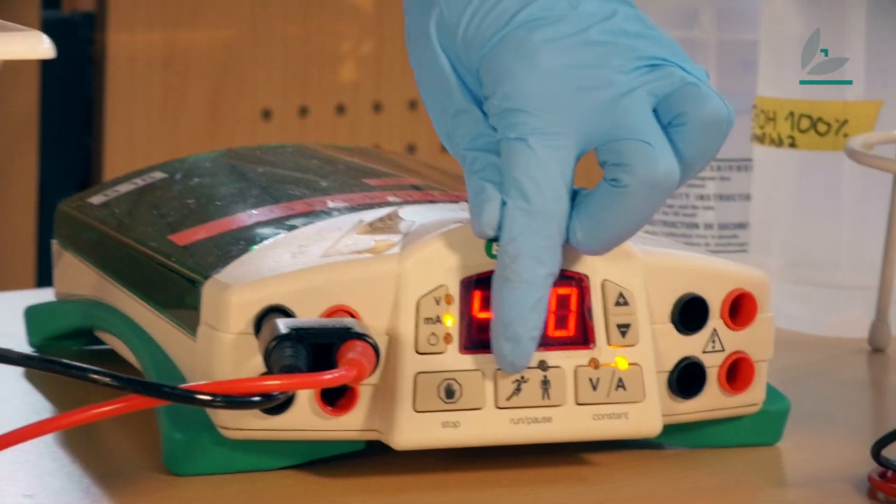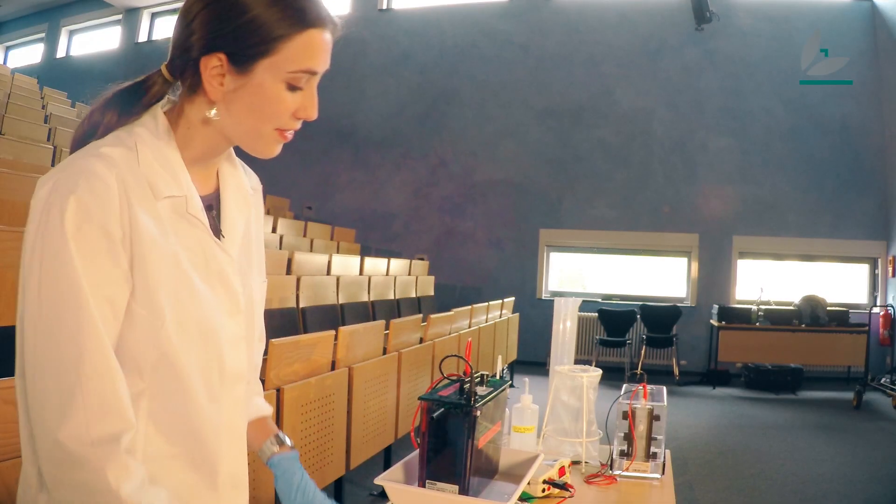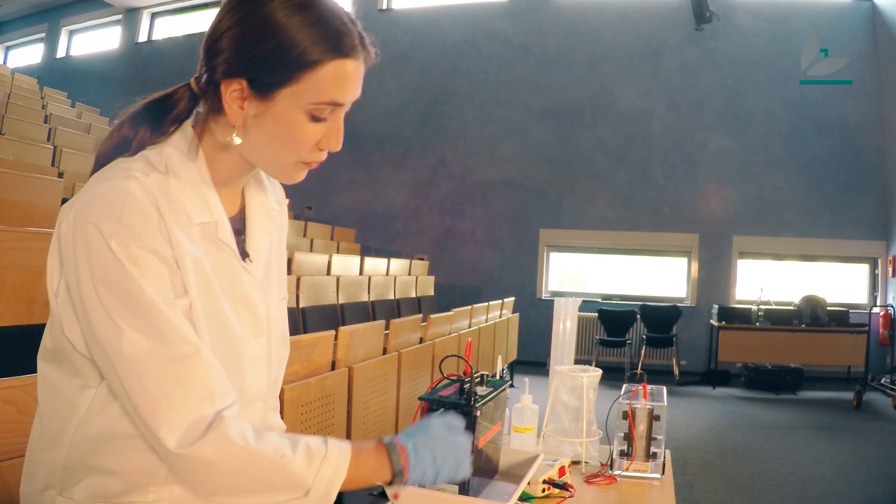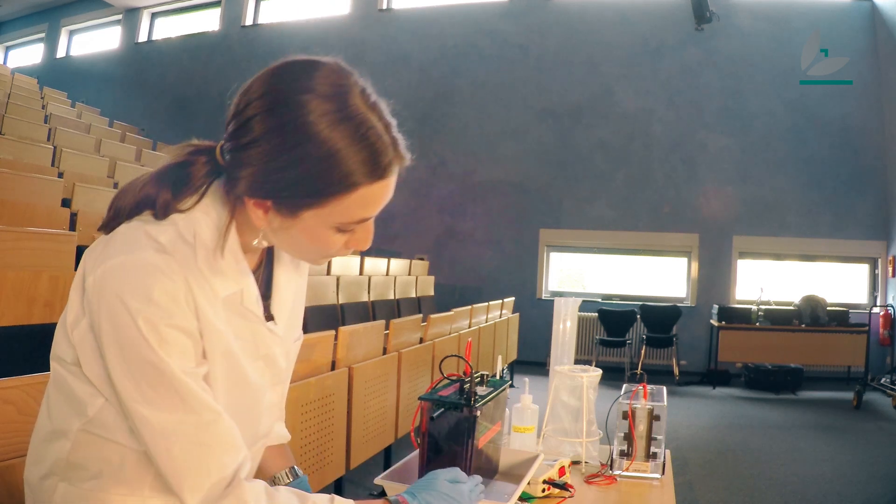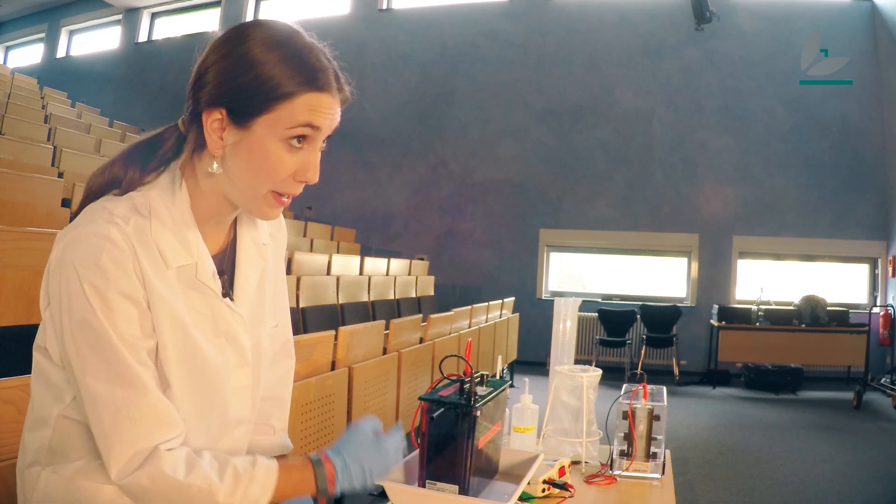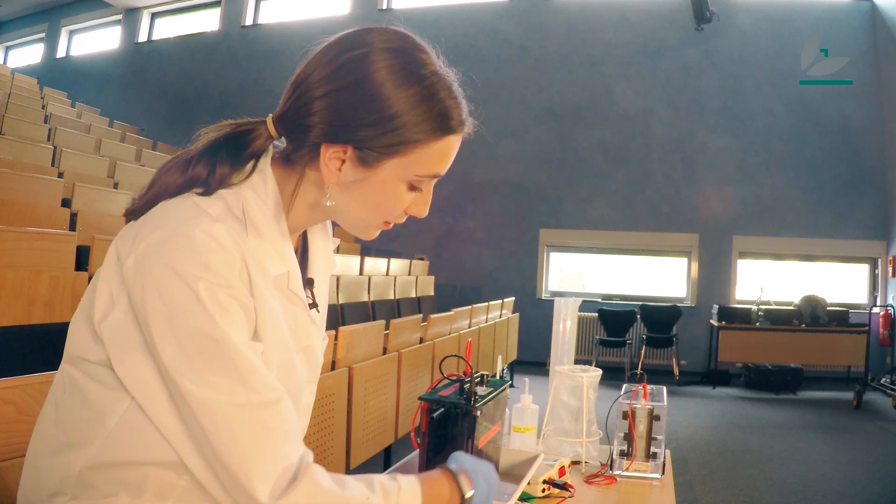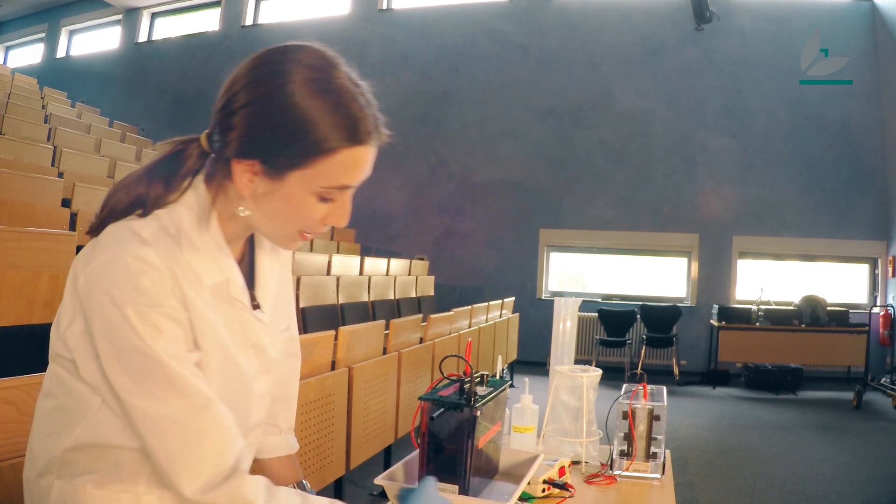So now I start the current and a current builds up that goes from the negative electrode on the front part to the positive electrode on the back part. There is a current from the front to the back that takes my proteins from the gel into the foil.